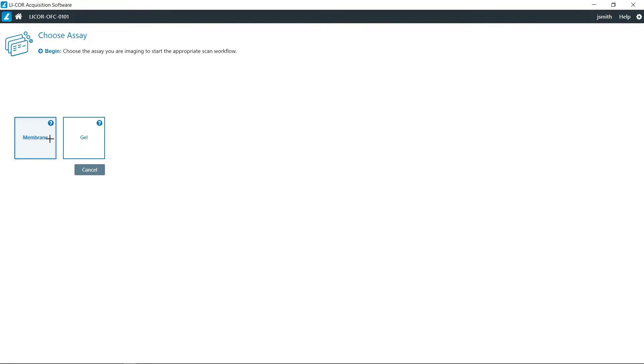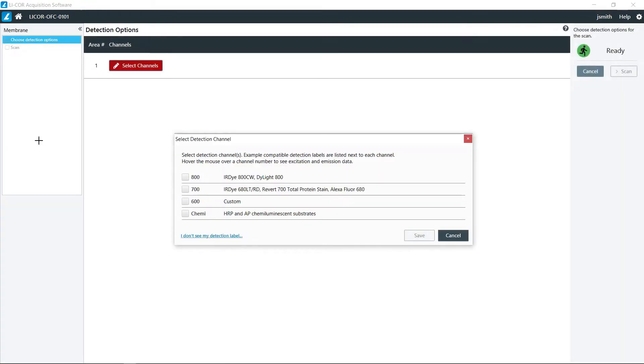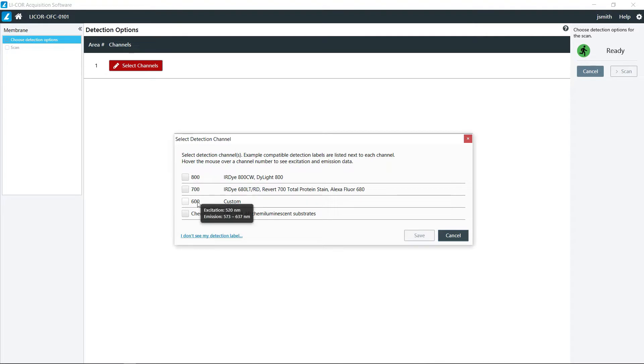We have two options, we can either do membranes or gels. For membrane, we have the option of the 800, 700 for doing fluorescent westerns, 600 is mostly used for ethidium bromide gels, and then chemi for doing chemiluminescence.